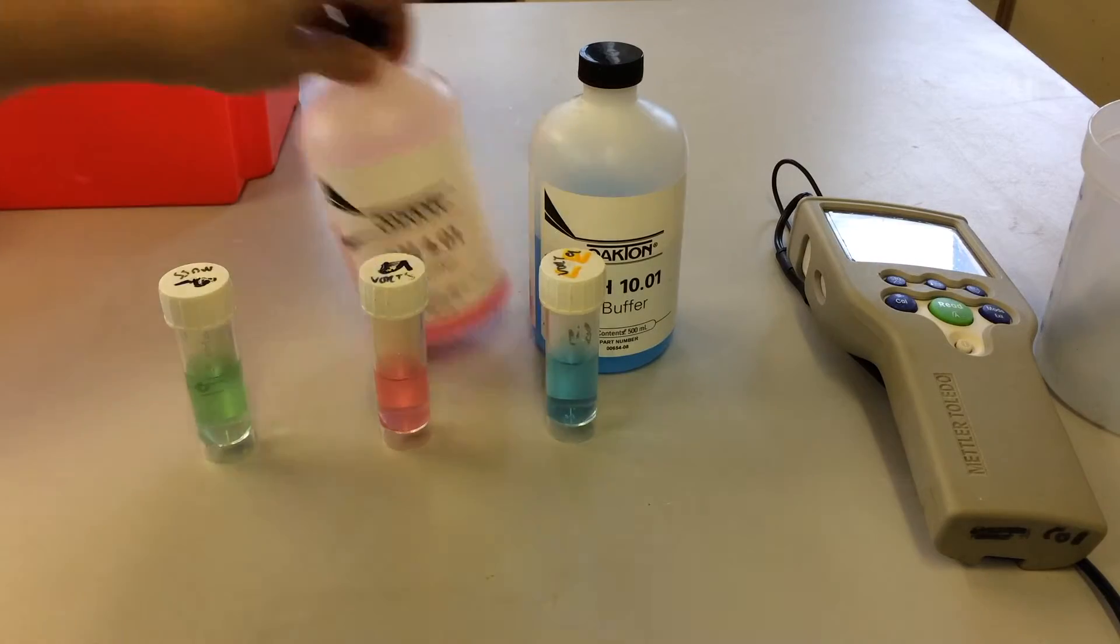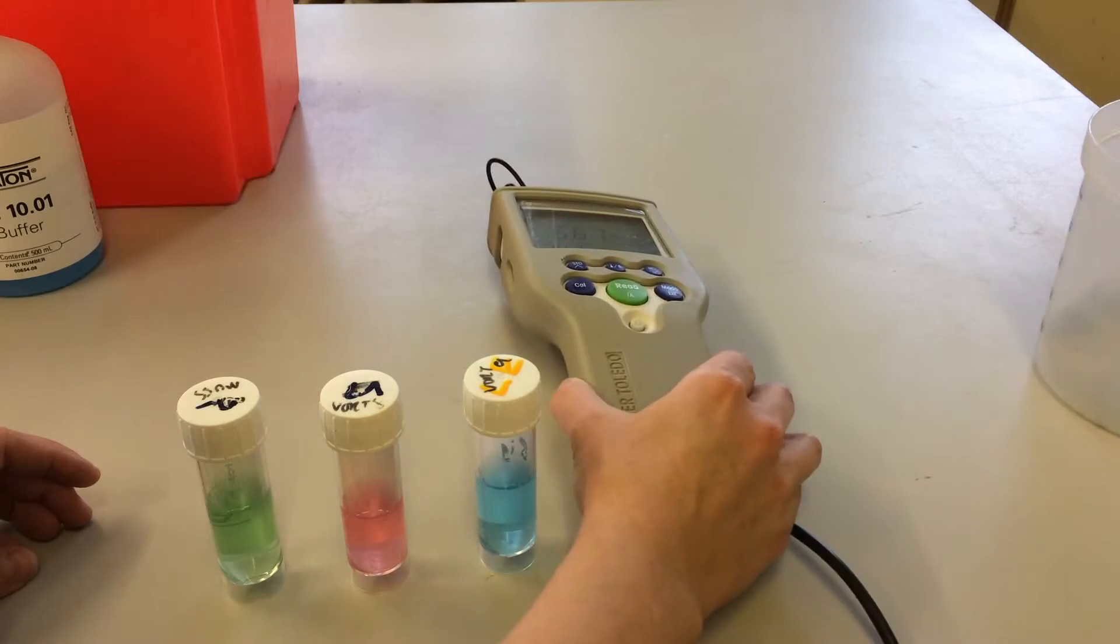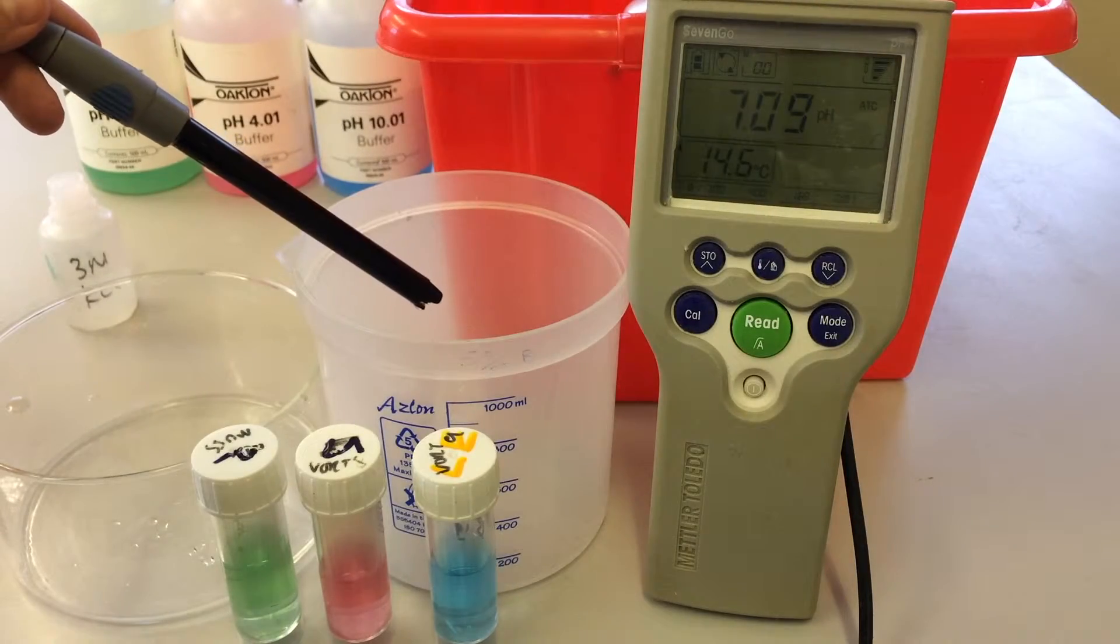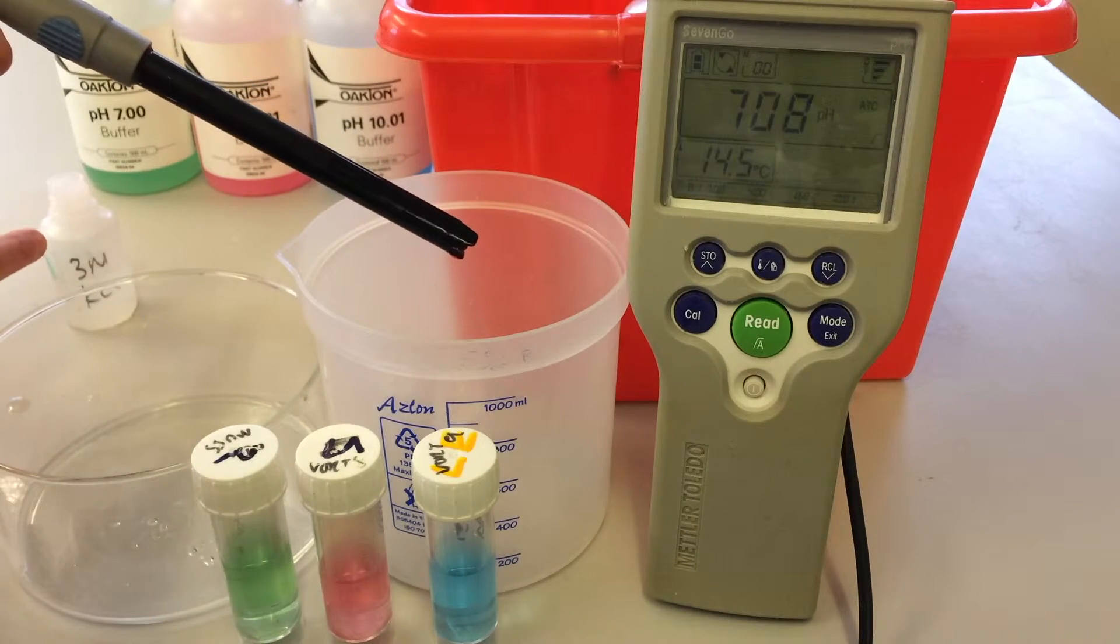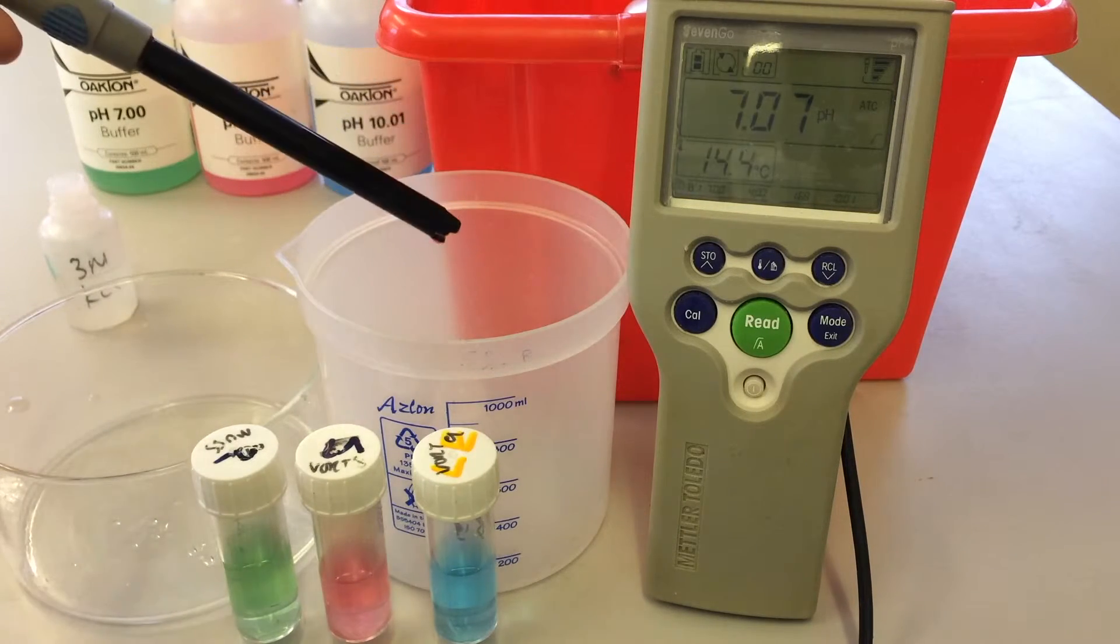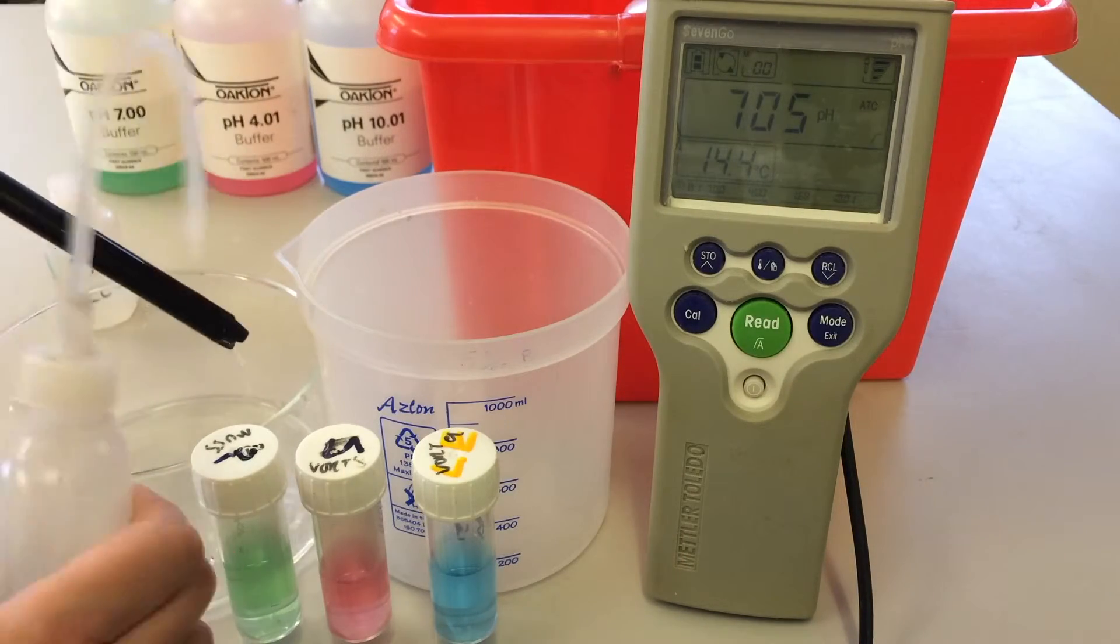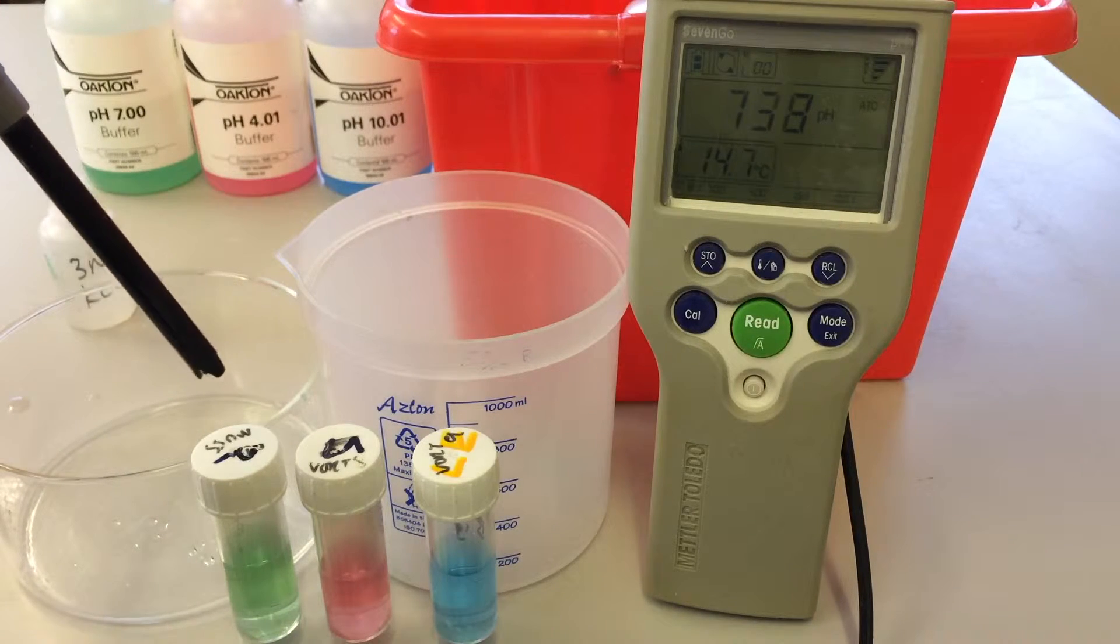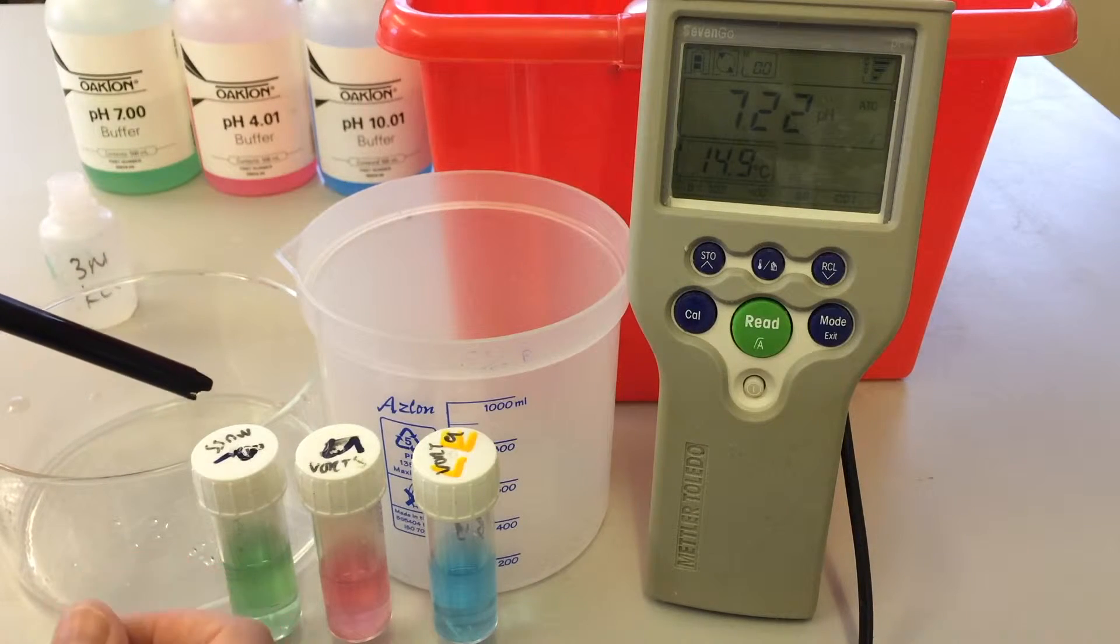So now we're going to calibrate our pH. I've just taken this probe out of this three molar potassium chloride solution, so I'm going to give this a rinse with distilled water first. Giving it a rinse, give it a gentle shake to get excess fluid from the end here, and then I'm going to place it into the first calibrating buffer.